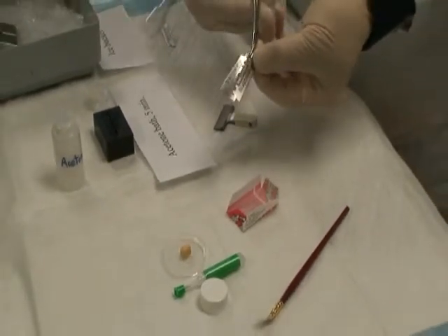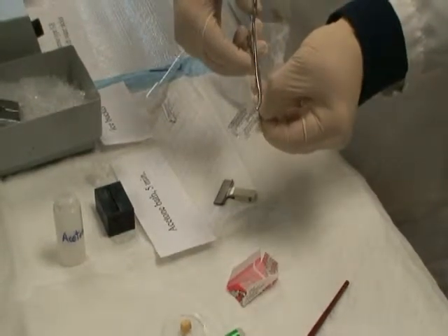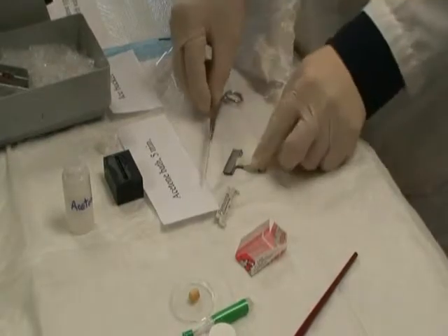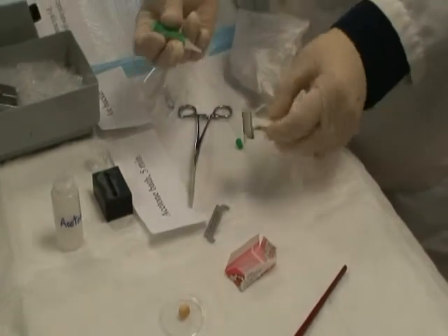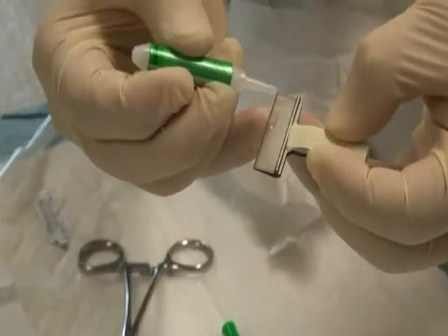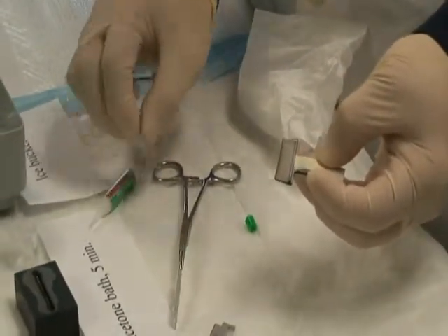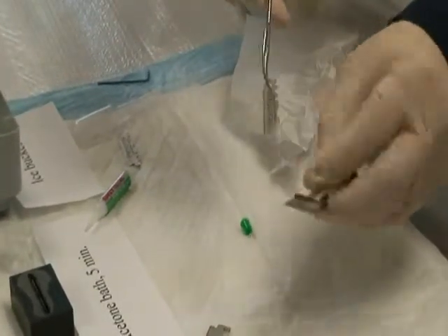Break the razor blade in half on its roots. Apply crazy glue on the outer one-third edge of the blade holder. Glue the blade to the blade holder.